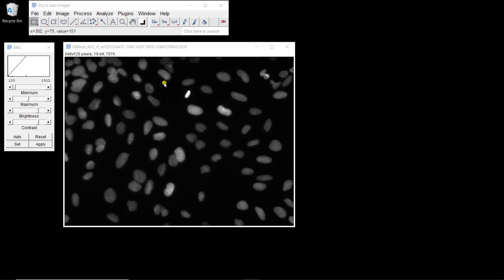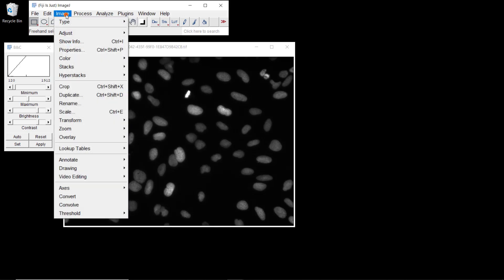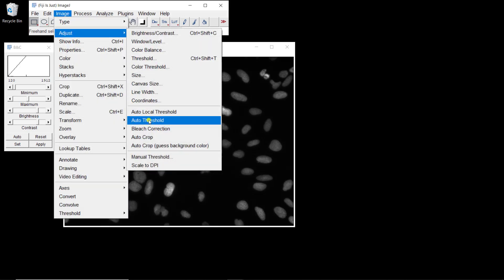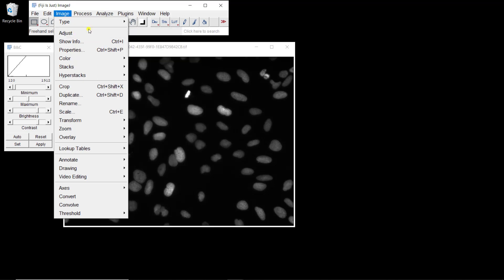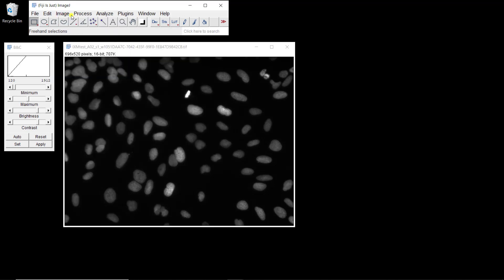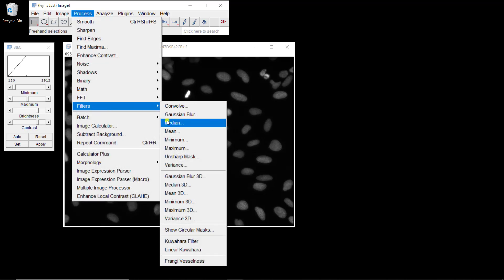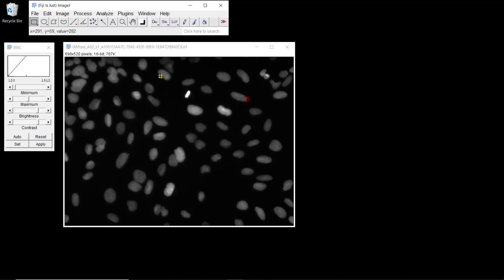We're going to use this nuclei image first. We're going to start with the most common way to do it, which is to use a threshold. ImageJ comes with a very nice feature, which is an option to try many different methods at once. But before doing threshold, you should always filter your image. We're going to use a median filter to get rid of the noise, so the thresholding is not too dependent on the noise.